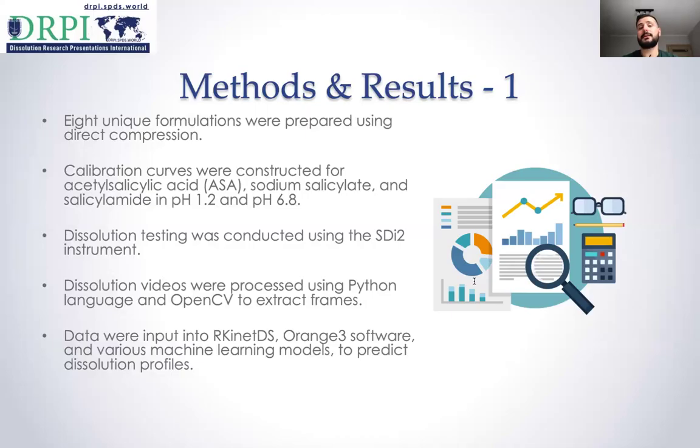Dissolution testing was performed using the SDI2 machine, which captures dual-wavelength real-time imaging data. So we had 280 nanometers for API visualization and 520 nanometers for the structural changes.